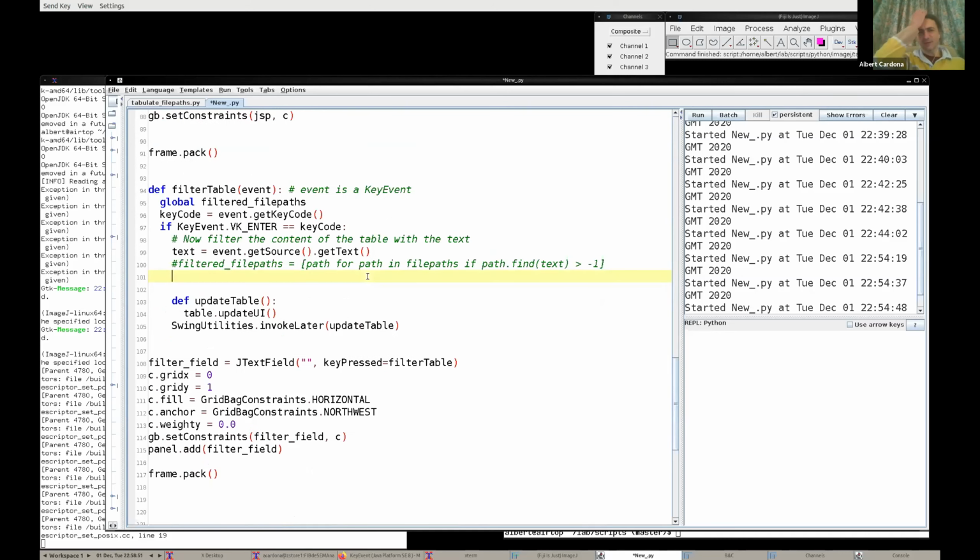So now we're going to define a regular expression with this text, because the minimal regular expression is just match the characters as you give them. In a way, the most simple possible regular expression is what we had done before, which is, does our string, meaning the file path, contain that text literally? First of all, we need to define the pattern. So we're going to do re.compile, and this compilation will be simply the text. Whatever's in there, consider it a regular expression.